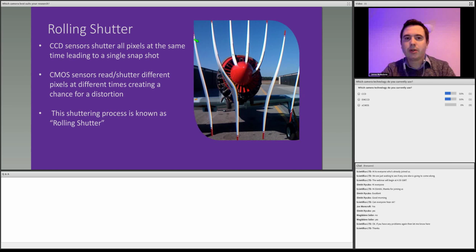If our whole area is changing intensity at the same temporal resolution as this rolling shutter artifact, say our cell goes very bright for a bit and then dims down again, if the top of the cell is showing up as bright, does that mean that is actually what's happening?